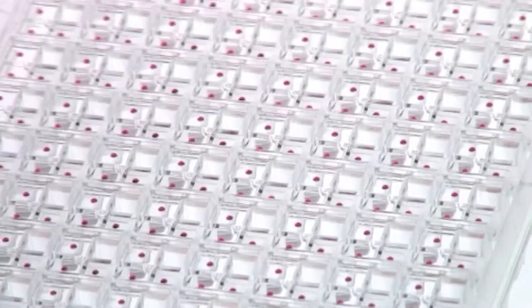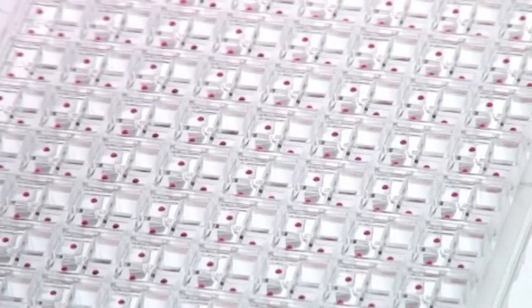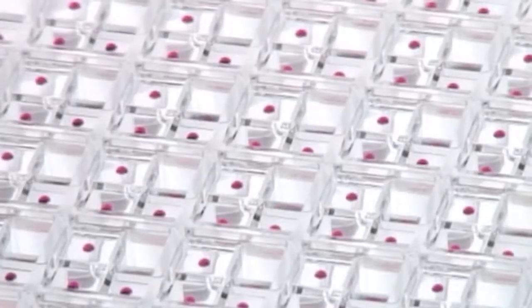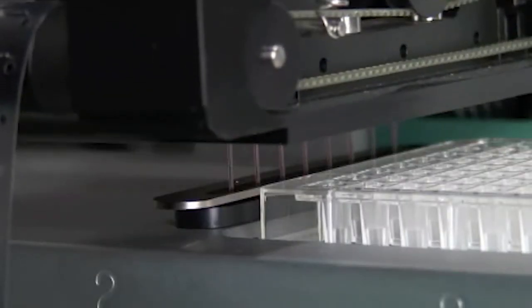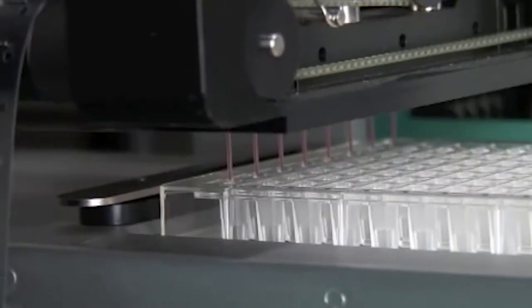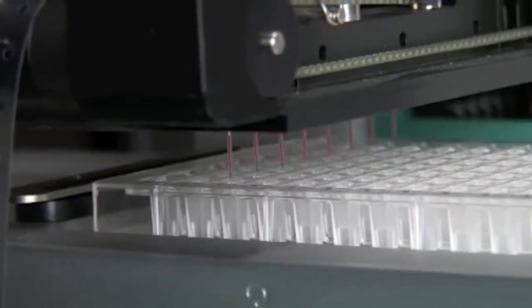Mosquito's really good for setting up sitting drops because its drop placement is so accurate that it places the drop perfectly centrally in the sub-well every time. Any sitting drop plates can be set up and it's also really fast. A 96-well plate will take less than two minutes and a 288-well plate, a triple sitting drop, will take less than four minutes. There's also no washing step in between plates so for setting up multiple screens it's really fast.